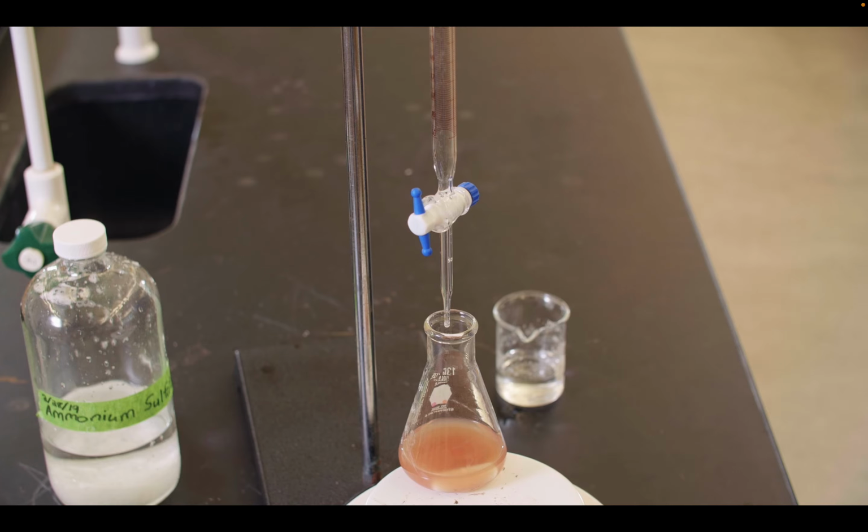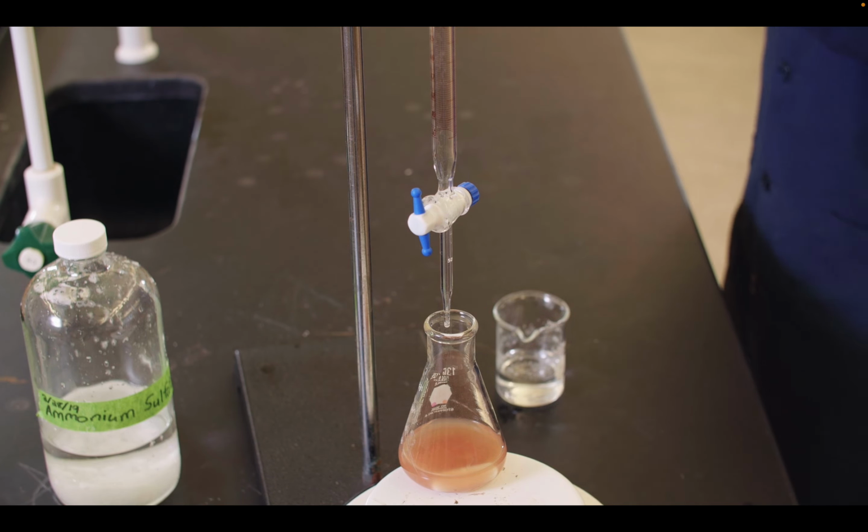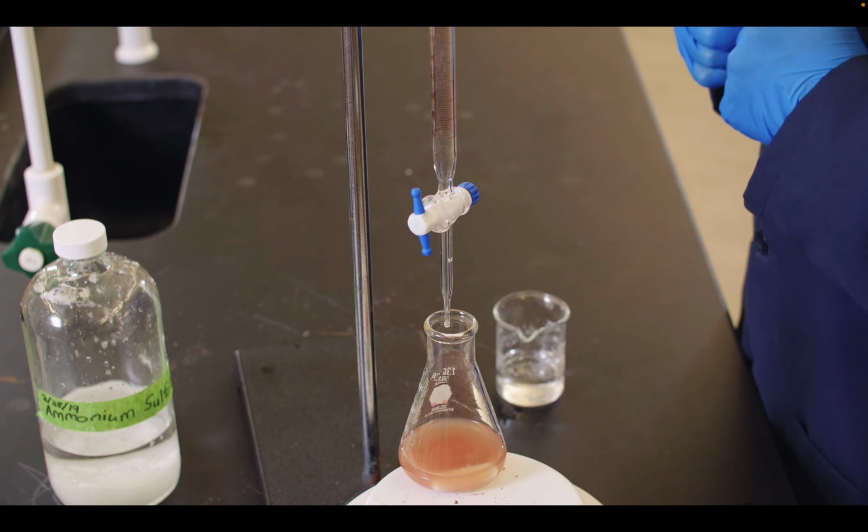All right, so again, because we need to get to that 60%, since we have 35.2 milliliters of our fraction 2, then we need to add a little bit more in volume to get to 60%. That's 52.8. So let's go ahead and add that. We'll start adding it, and we'll show you the result.